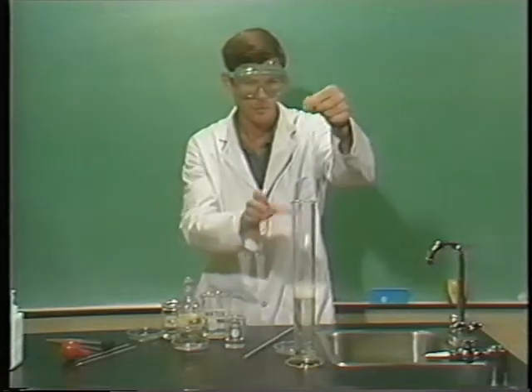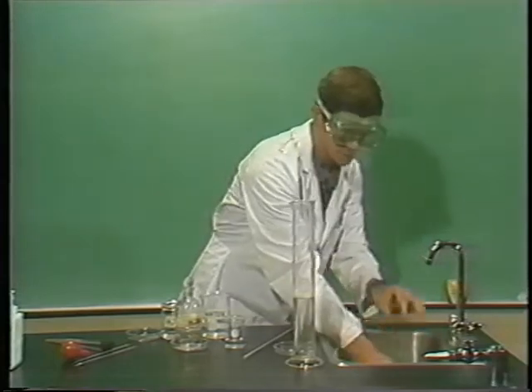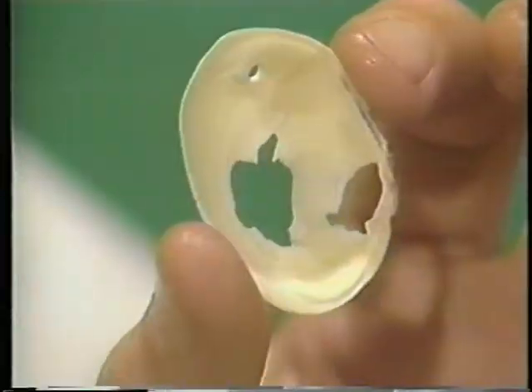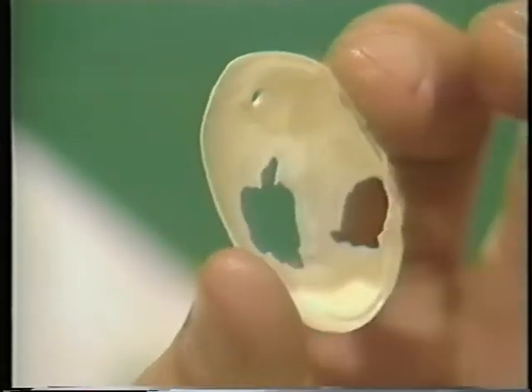I'm going to quickly remove this before the seashell gets totally eaten away, put it in this Petri dish down in the sink, and cover my acid up once again because there are some fumes coming from it. I've actually tried this experiment previously, and here's what happened to the first seashell I tried. Burned two holes right through the shell, and this shell was in the acid only for about 30 seconds. This demonstration should convince you to treat acids with respect. And remember that strong bases are just as bad, so treat them with respect too.